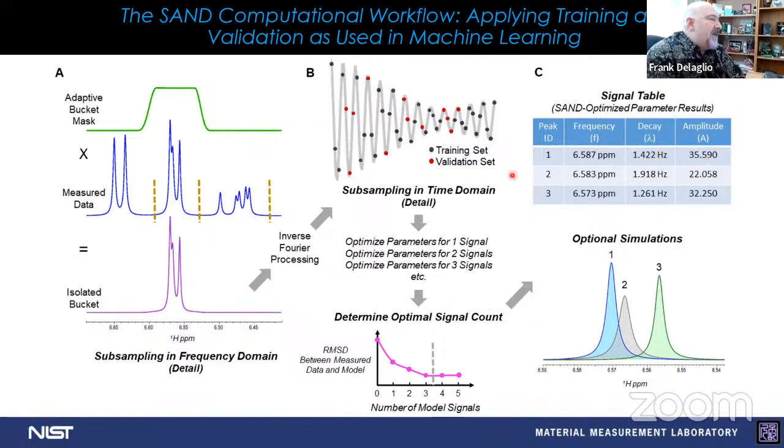Okay? And it was our goal to try to set this up in a way that required no user interaction to perform and didn't need a graphical interface in order to do this analysis, which means that we can conveniently apply it to batch and analyze data, and we could apply it in a way that didn't depend on the judgment of an operator in order to get the results.